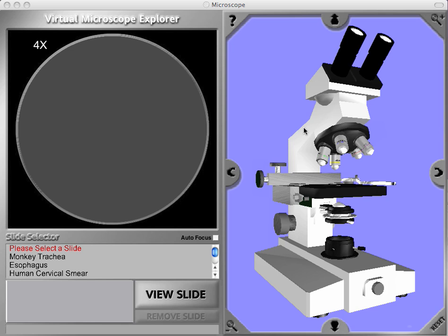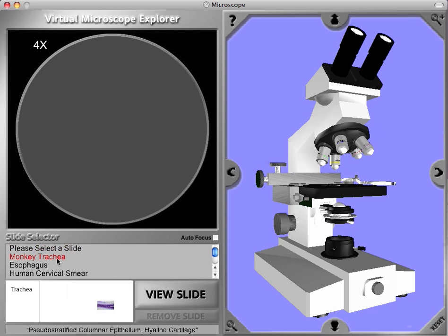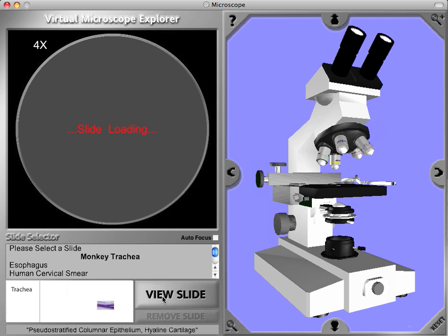To view a specimen, you simply click on one of the names in the list. Let's check out the monkey trachea — when we do that, an image pops up in this window that views the specimen as you would see with your naked eye. To load the slide onto the stage, we click 'View Slide,' and the slide flies out of virtual space and locks onto the stage.